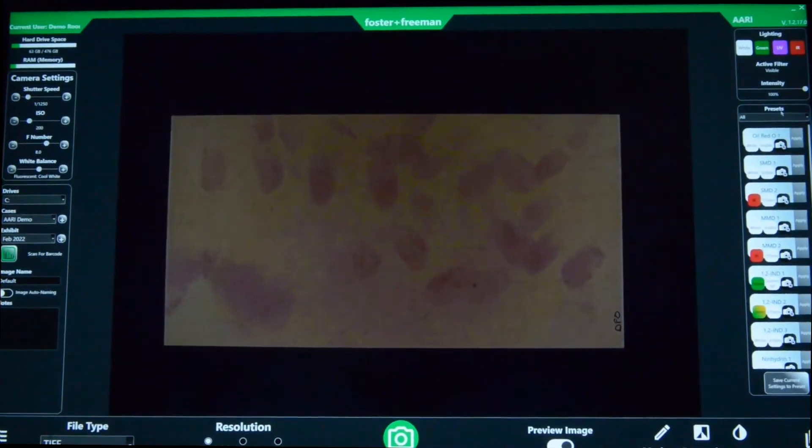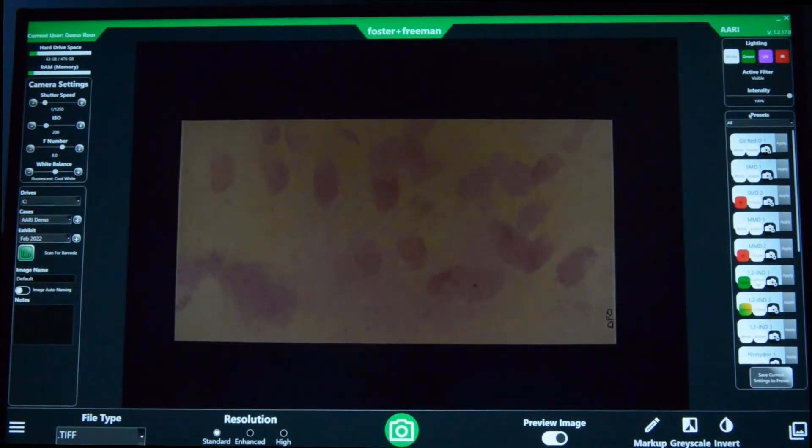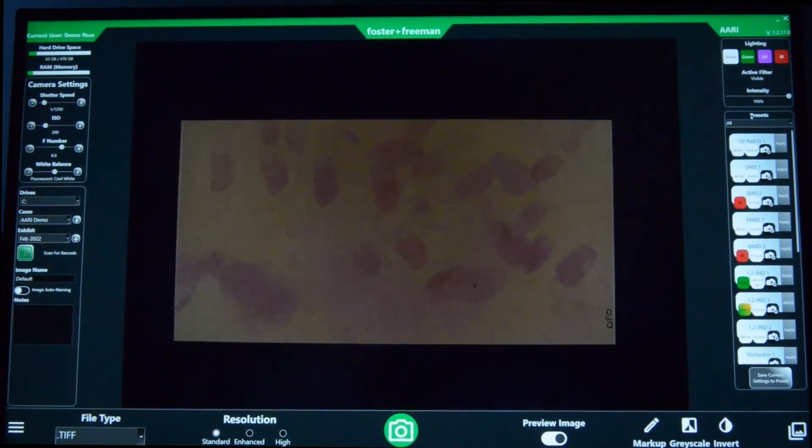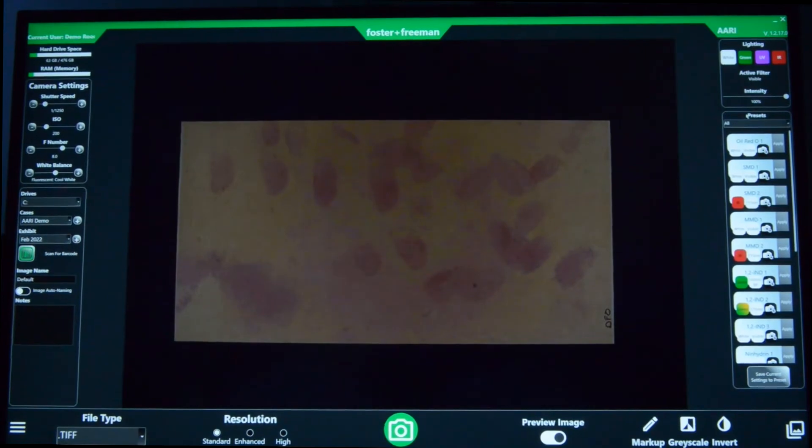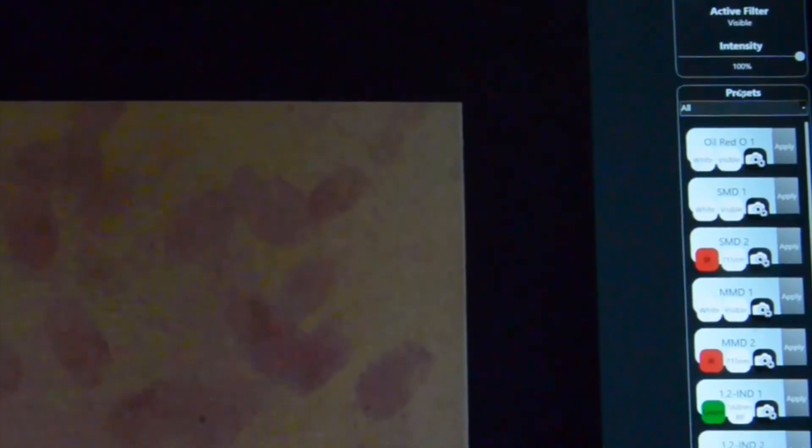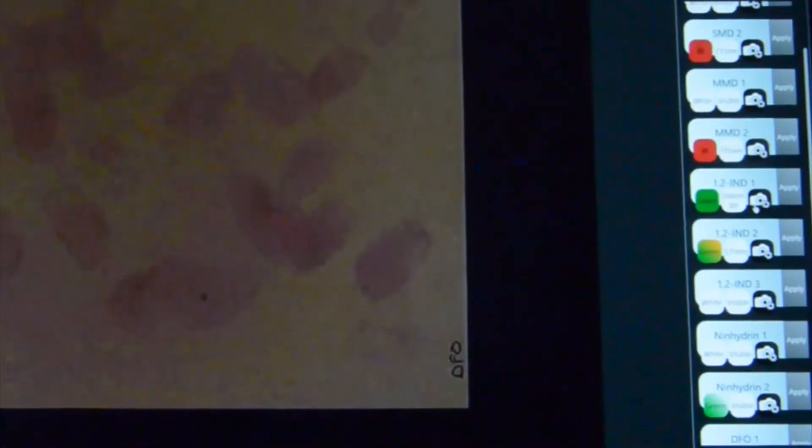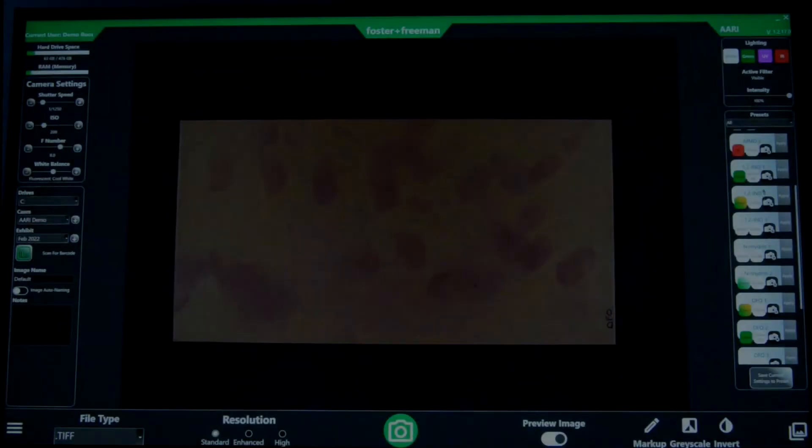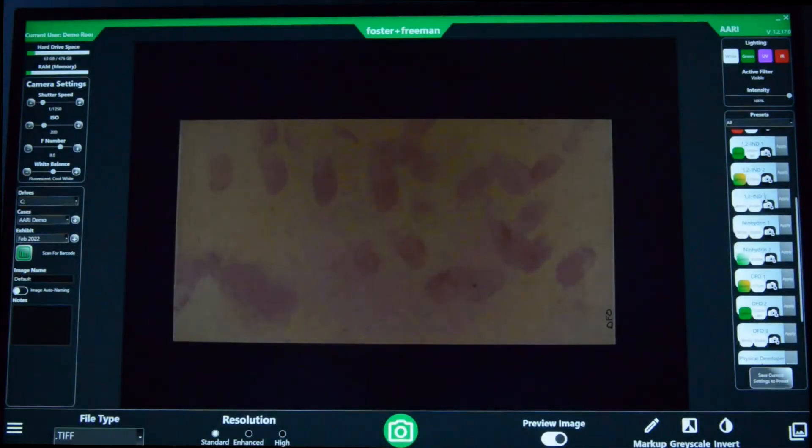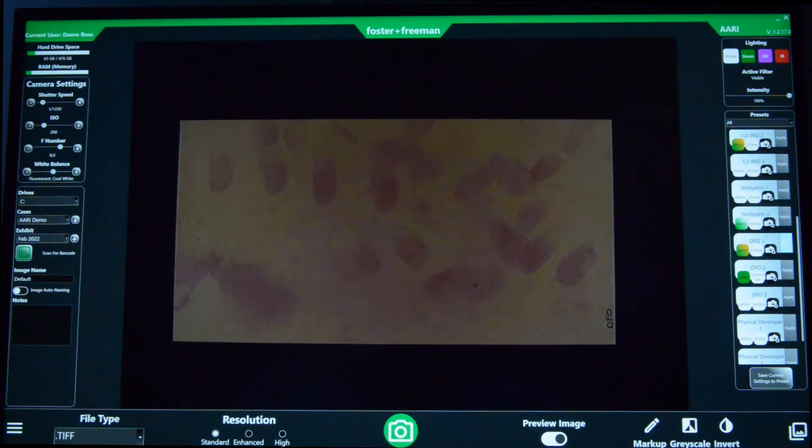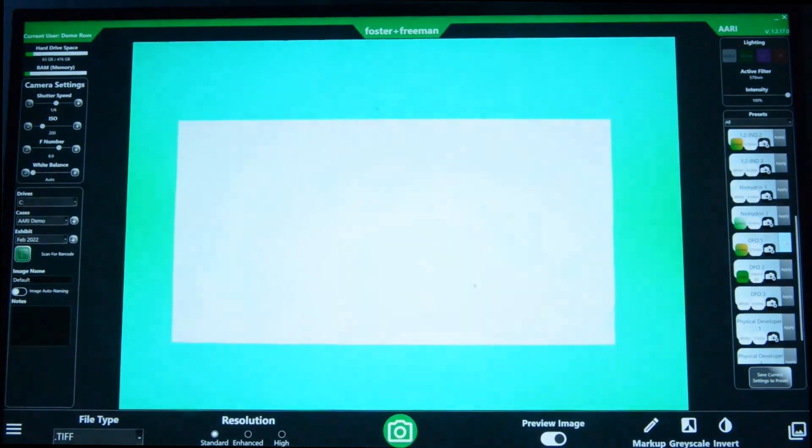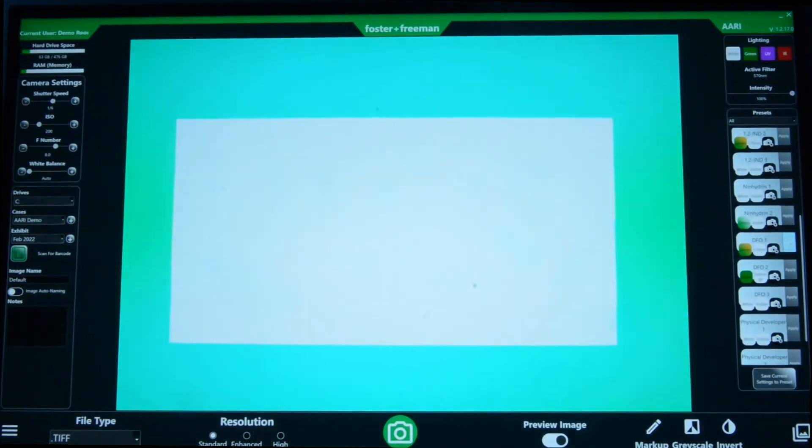Below this we also have a number of presets. We've put in the filter and light combinations that you specifically need for different treatments and you can navigate through the different treatments and pick simply a preset and it will apply those light source and filter combinations for you.